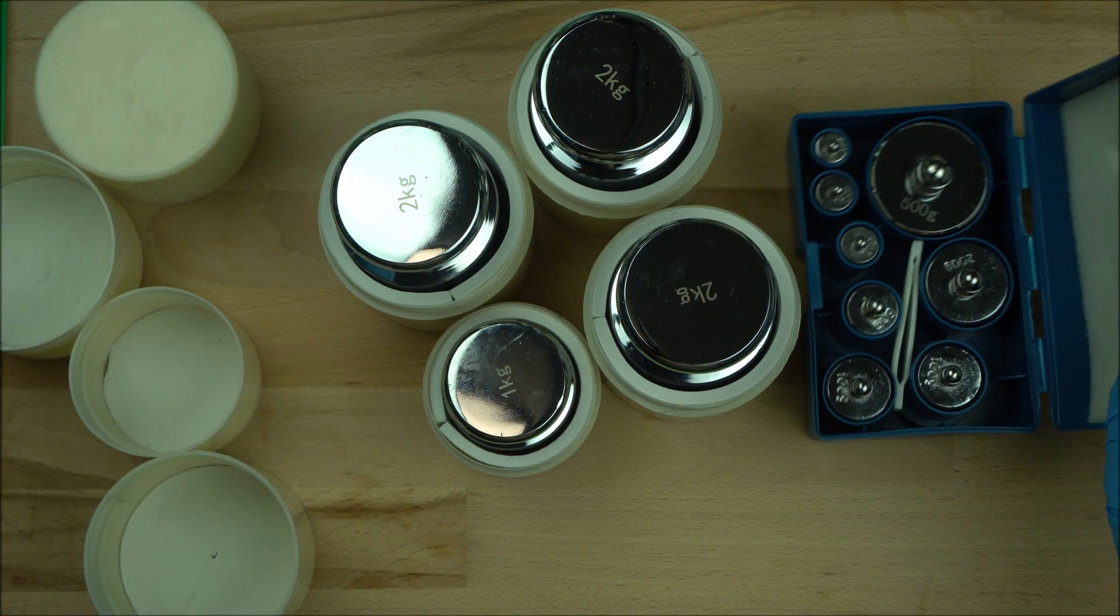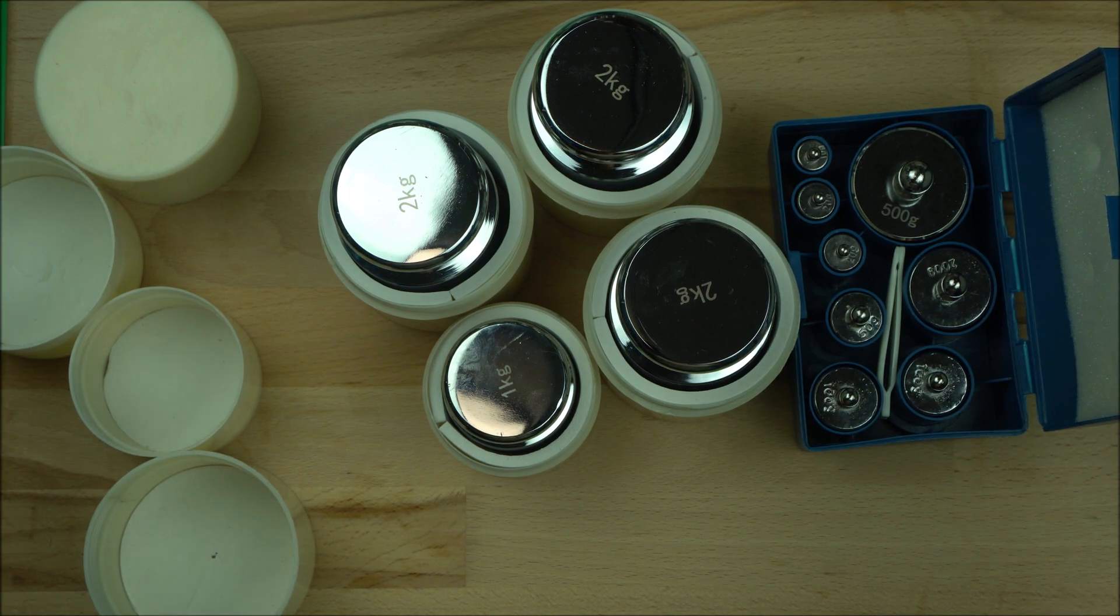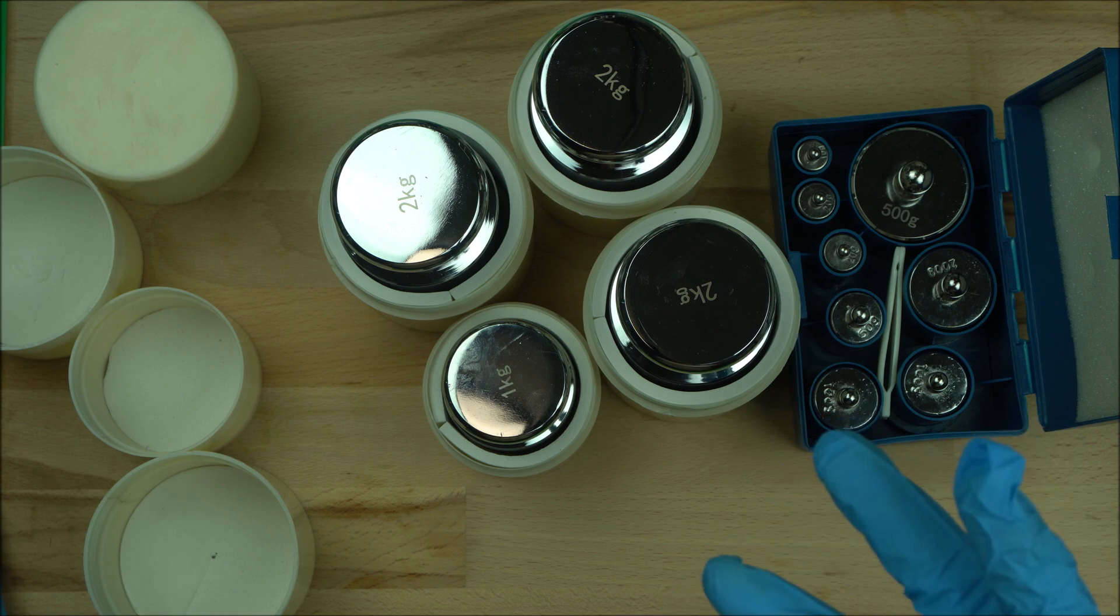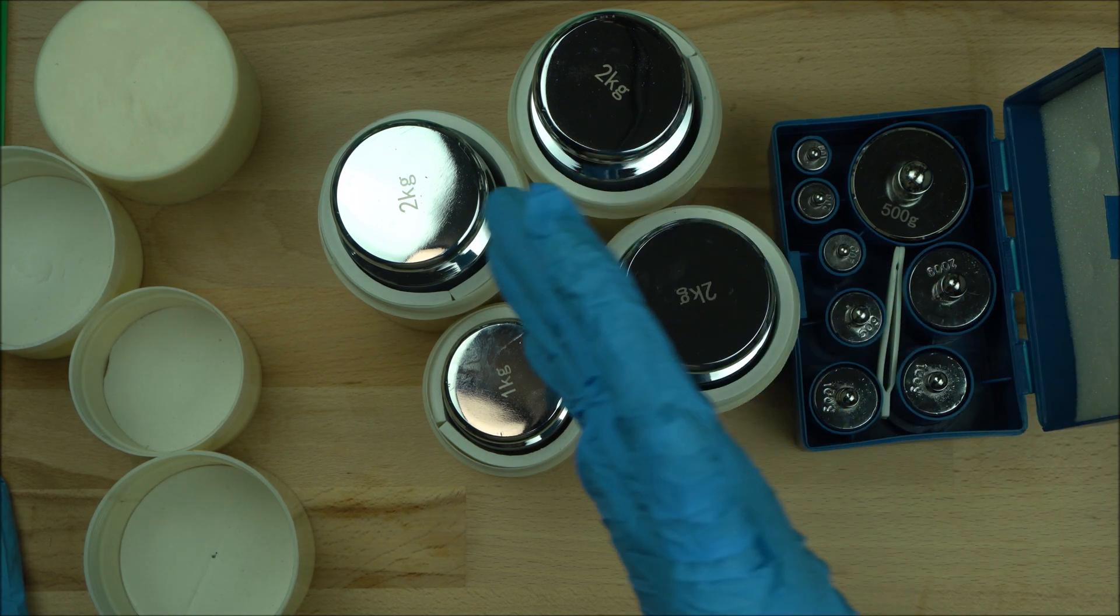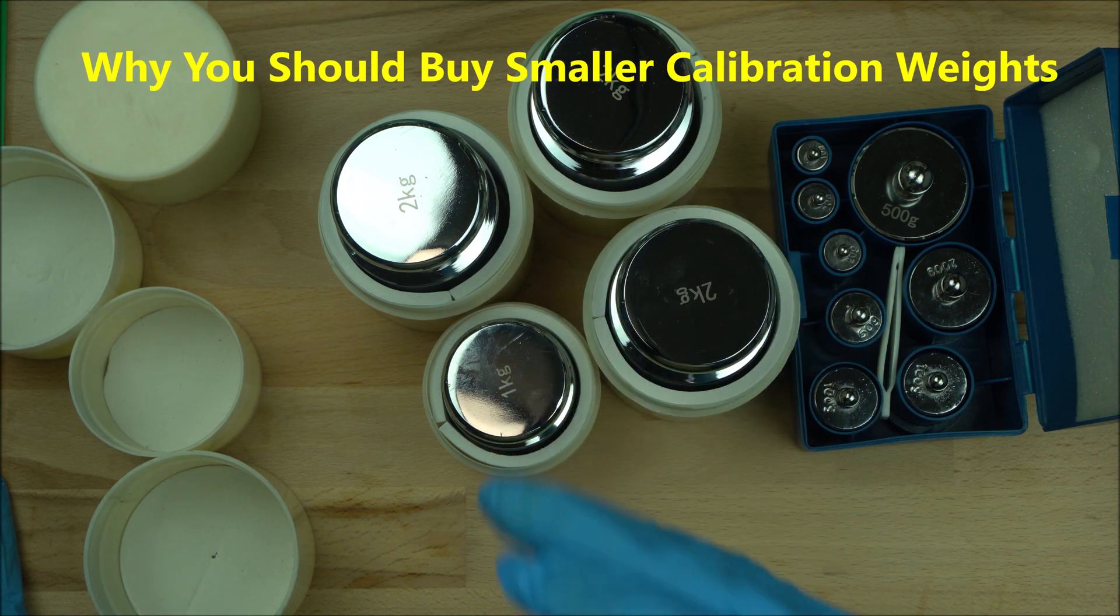So if you have a calibration scale that's not accurate right now, make sure you go for this. Just see the description box below, and trust me, this has saved me tons—I mean tons—of hundreds of dollars. When you work with high-end lab scales, you know for sure you need a lot of calibration skills.